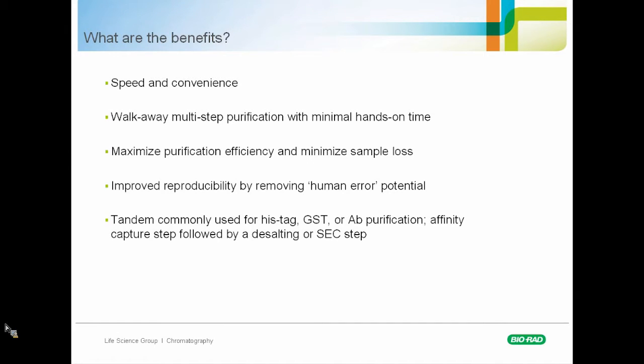optimal separation conditions, and then also how you can bring together multi-step purification methods, and instead of doing them in the more traditional sequential way, by bringing them together into an automated multidimensional chromatography method. And we'll be looking at the considerations of designing these sorts of experiments and also be looking at some examples.